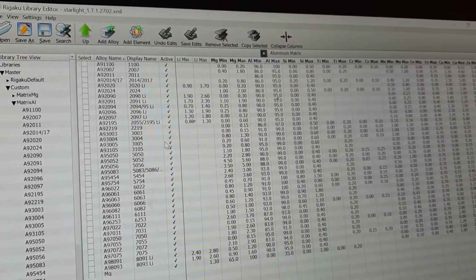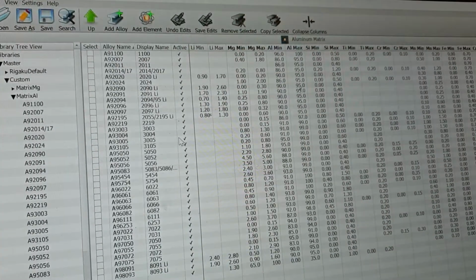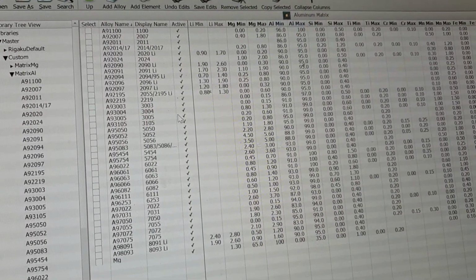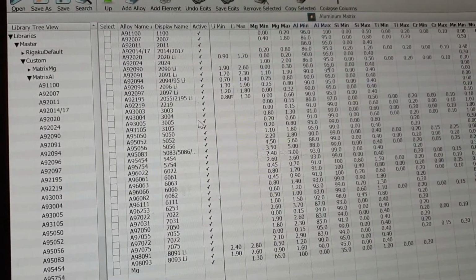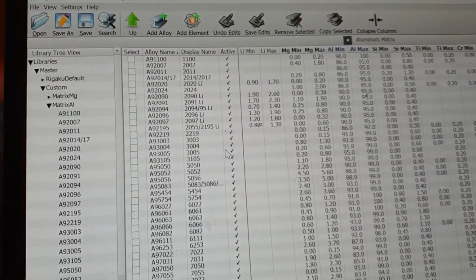So if you said to me, Paul, I'm missing... you can see there's 1100, but you can say there's maybe 1152. Let's say it's a grade of aluminium. I would just add a line, add the grade, save the file, and put it back in the gun. Can you do, like, a 9985 0610 alloy? Yeah, the high purity one. Yeah, you can do whatever.